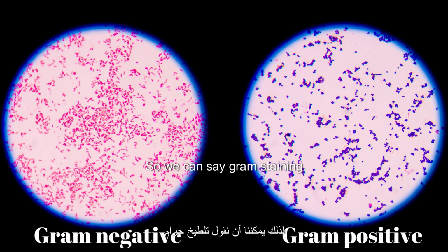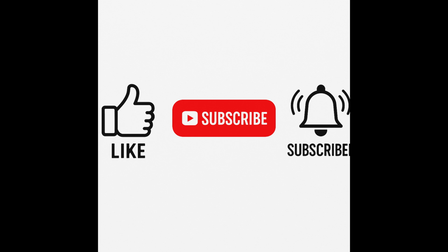So we can say gram staining helps microbiologists identify the bacteria quickly, which is critical for diagnosis and antibiotic selection. And with that, we have reached the end of our practical today.